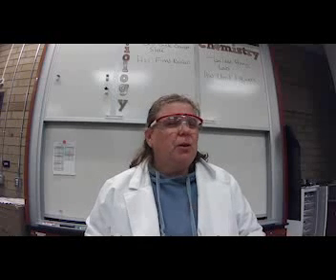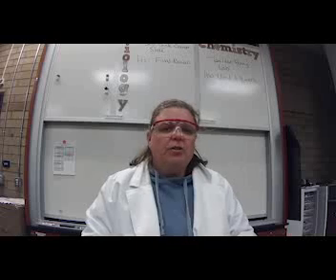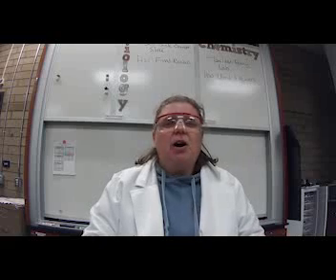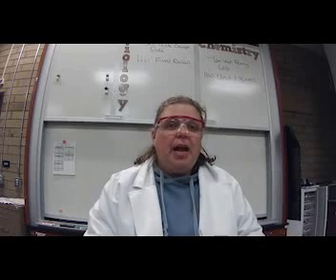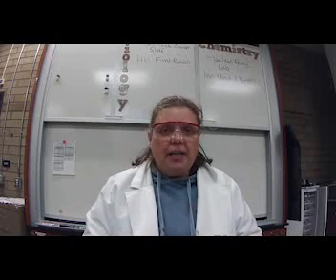Remember, you've got your 3 properties of your metallic bonds. You've got your ductility, or ductile, which means we can turn it into a wire. We can stretch it out without breaking it. The other thing we have is conductivity. We're going to use our conductivity meter to see if it conducts electricity. And then there's luster. It's very nice. It's usually shiny.